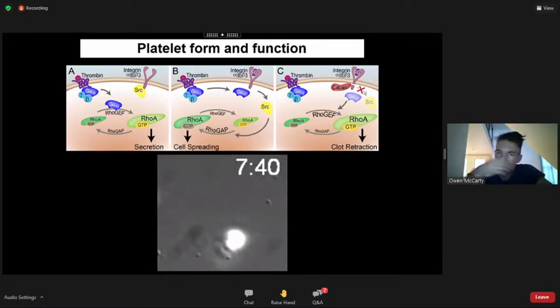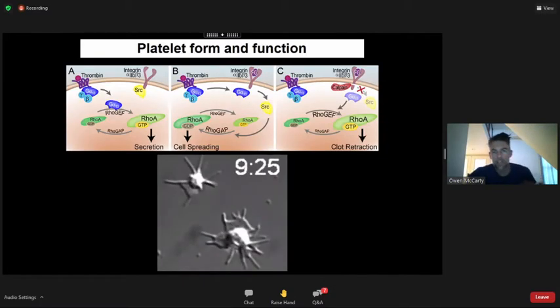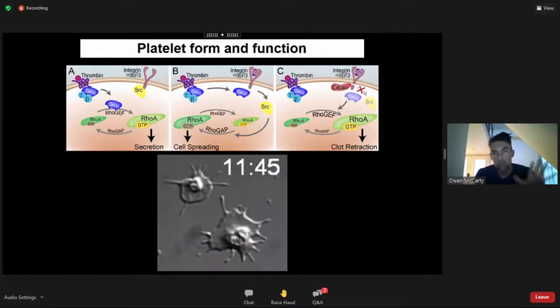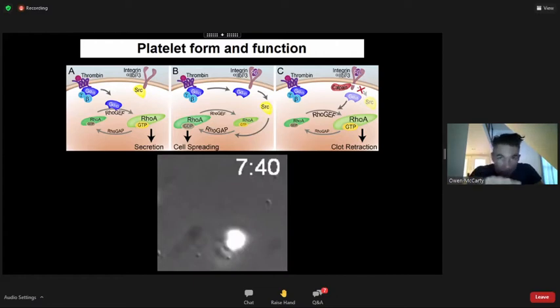By doing that, that's an engineering style of approach: I built a microscope to actually study how cells would change their shape. And since I measured something for the first time, I could use that measurement technique to then decipher the top cartoons of how did it communicate, and what was all the cell biology behind it.